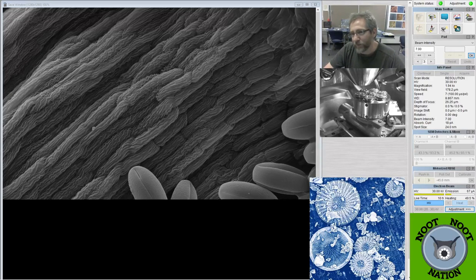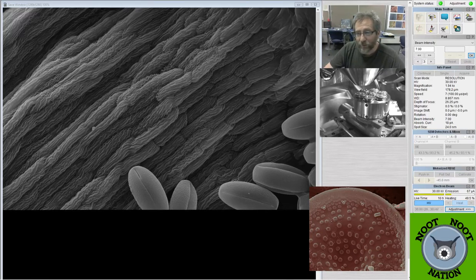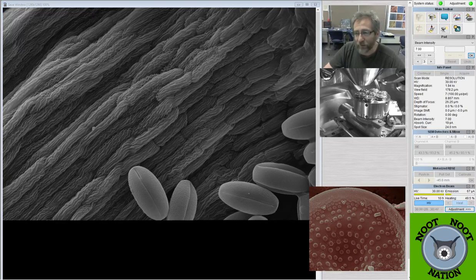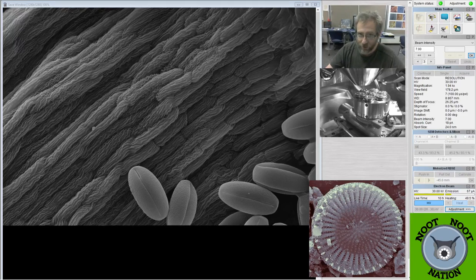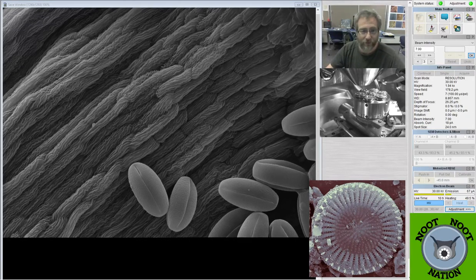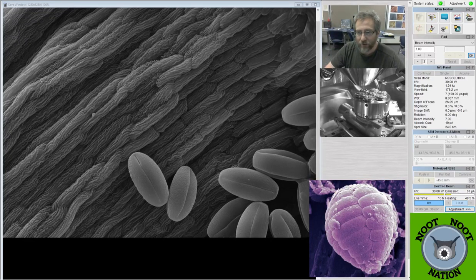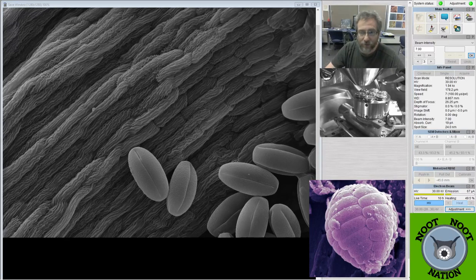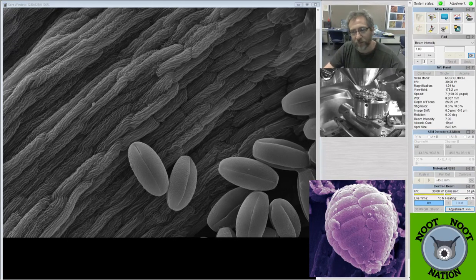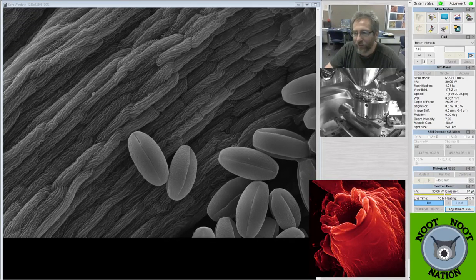Do you have any advice for someone who has no experience identifying different types of diatoms? Yeah, Diatoms of North America website. If you're looking at North America, I don't know if you're from North America, but that's a good place to start. Also, just watching my stream probably will give you some pretty good ideas for a lot of it. If you have questions about diatoms in particular and you're looking to ID something, just take some pictures and put them in my Discord. So I can help, and I can explain to you what it is you should be looking for to help you reliably figure out what you're looking at.